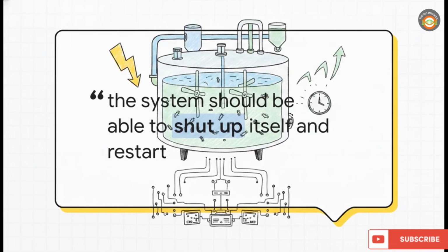As the source text outlines, in the event of a power failure, a properly computerized system has the ability to shut itself up and restart and gradually build up to the original level of activity. Just think about the sheer complexity of that for a second. A blackout hits, the mechanical stirrers stop, the aeration halts, everything goes dark. But the computer system instantly recognizes the emergency, triggers safe shutdown protocols to preserve the batch, waits for power to return, and then systematically resurrects the entire living ecosystem entirely through code. It carefully ramps the dissolved oxygen and nutrient feeds back up safely to avoid shocking the microbes.